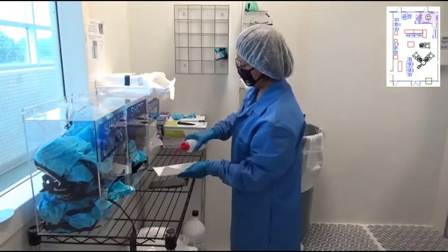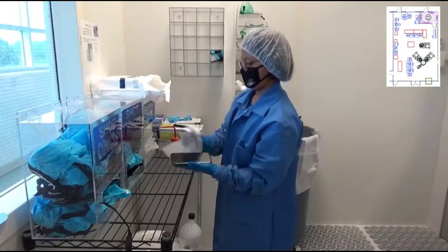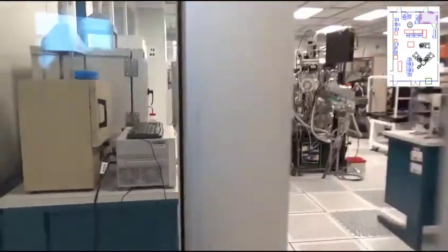Before you enter, make sure to wipe down any electronics or outside objects with the provided solution. You can bring in laptops, chargers, and phones, but please do not bring in any paper other than clean room paper. We will now go through a quick tour of the facility.